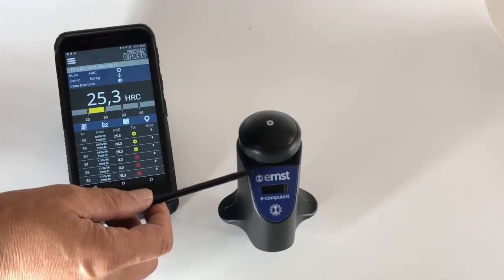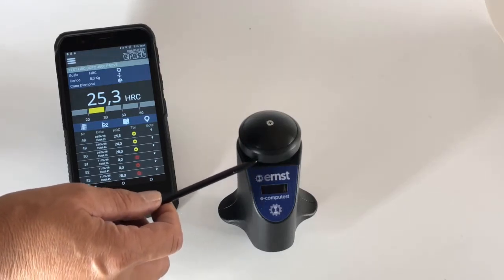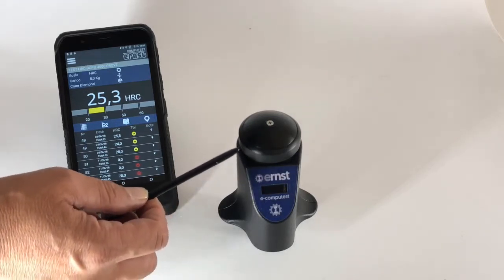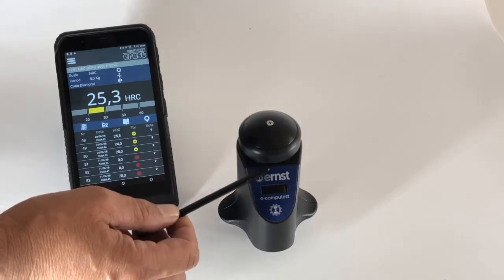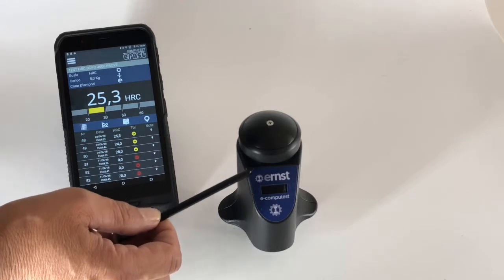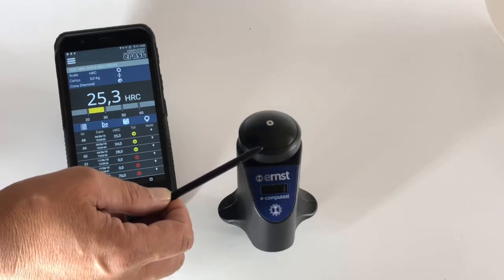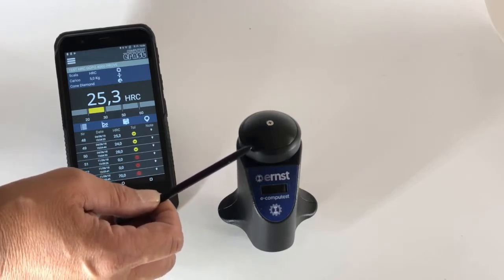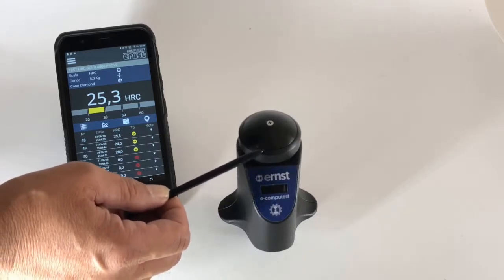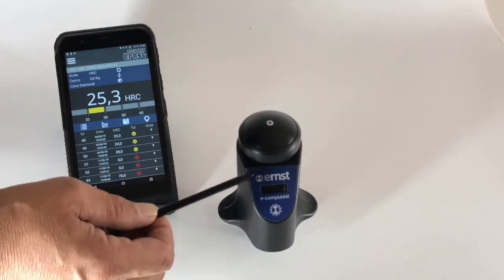Let's go through the main characteristics of our new Computest. The Computest is a portable Rockwell hardness tester with a native Rockwell scale using a spring-loaded system. The measuring ranges available are HRC, HRB, HB30, and also Vickers as well as depth (DPTH).